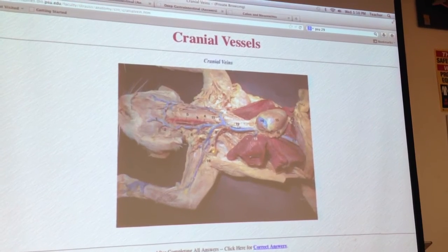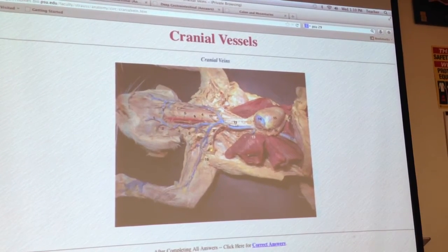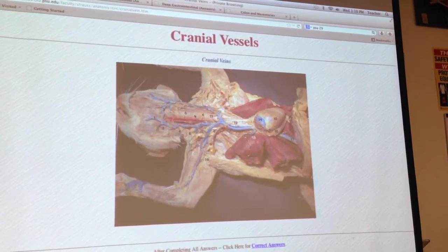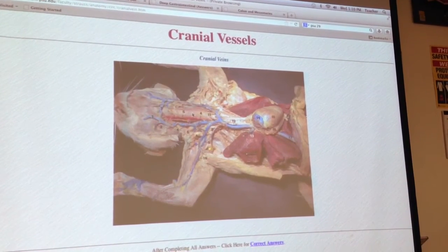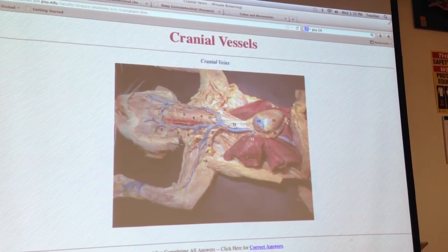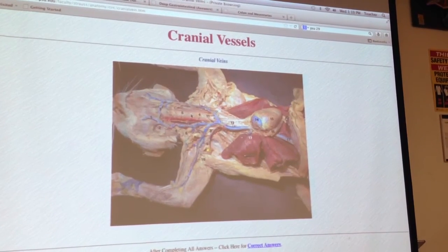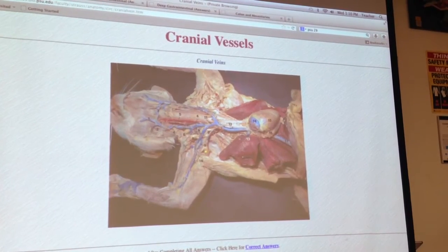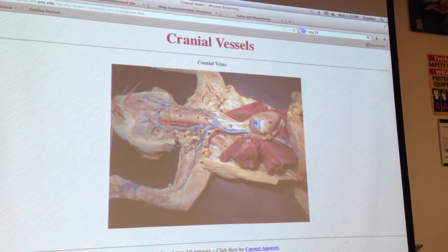Another thing you can do if you are having trouble seeing it is pick up the trachea and bisect it, just cut it in half, and you can lift it one way or another and look underneath and see the esophagus. So, yeah, two ways. I don't have a view of it, unfortunately, but it's pretty apparent once you lift this up that there's this big sheet underneath it.